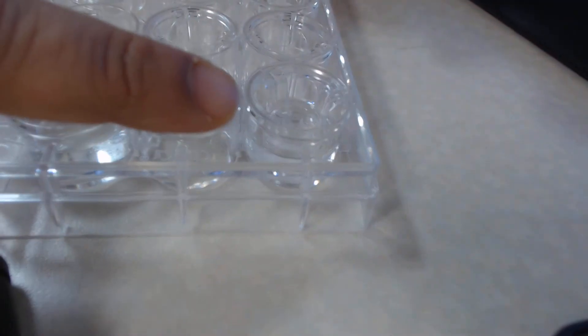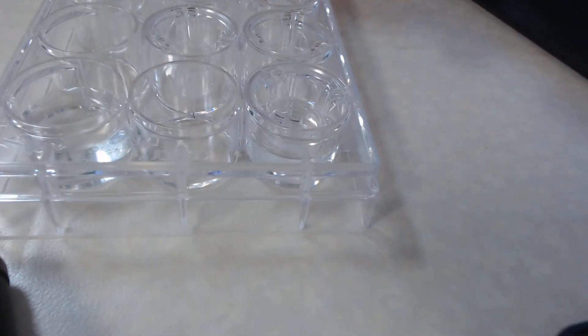First, I added—this is a Corning 3460 12-well transwell system. I added 500 microliters on top of the insert and 1.5 ml inside the well of the well plate.